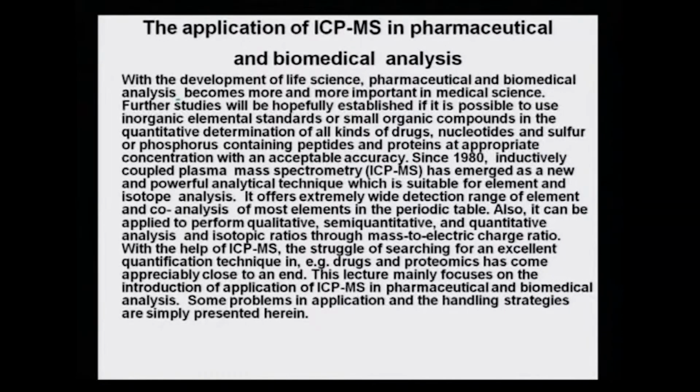With the help of ICP-MS, the struggle of searching for an excellent quantitation or quantification technique in examples like drugs and proteomics has become appreciably close to an end. This lecture mainly focuses on the introduction of the application of ICP-MS in pharmaceutical and biological analysis methods. Some problems in application and handling strategies are simply presented here.